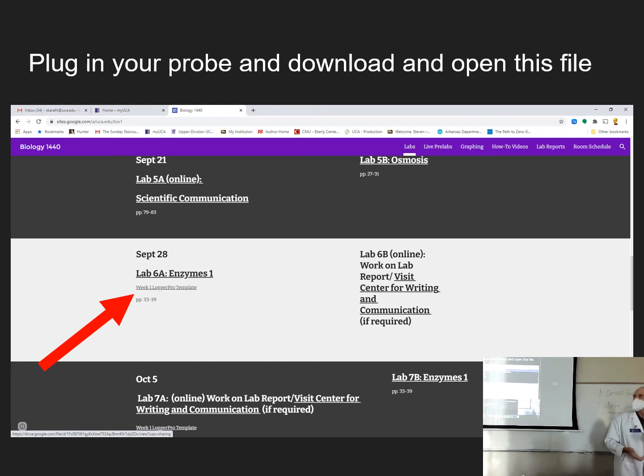So what I want you to do is to log into the computer. Let me just show you how this hooks up. This LabPro unit here, I tried to hook them all up earlier. Hopefully they're all on and working. We'll find out. But the probe here plugs into channel 1 on the side of this thing. This one doesn't have any lights on right now, which concerns me slightly, but we'll see what happens. Oh, there it goes.